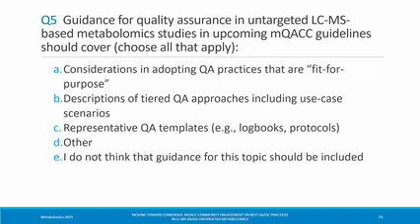So there's consequences for not doing an audit, right? So we need to be aware of that. And an audit doesn't mean that you get some company external to come and audit your research lab. That's not what we're talking about. It might be just grab your PhD students and say, today we're gonna do an audit of the lab and do an audit of all the protocols and the inventory and chemicals and so on, right?